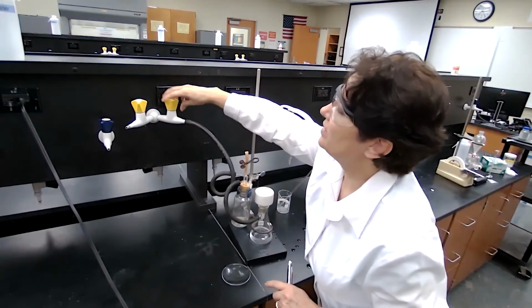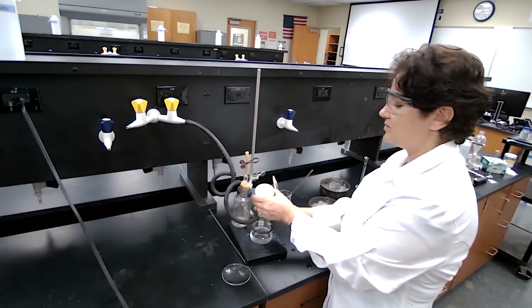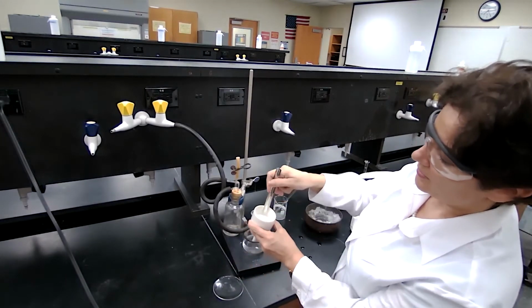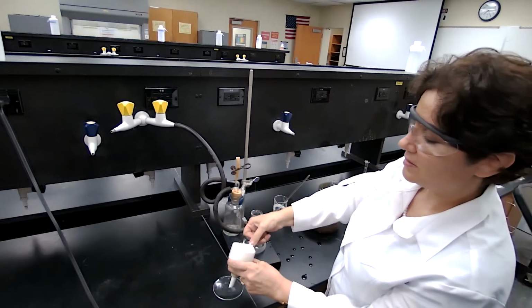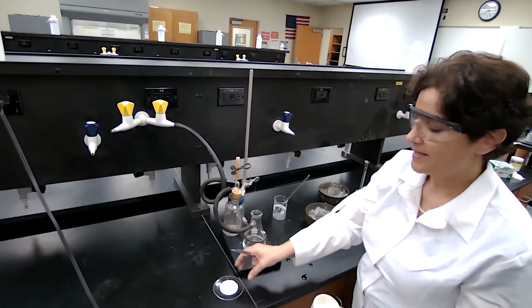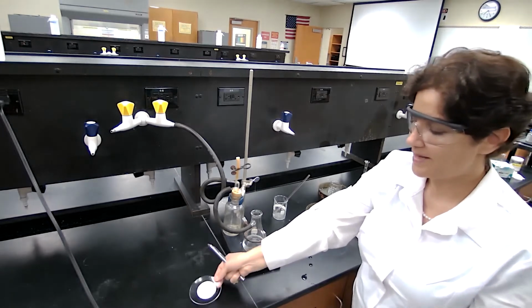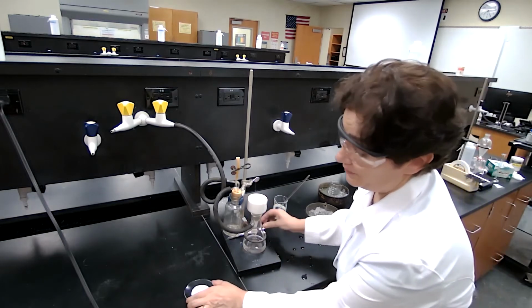After the extra 5 minutes of applying vacuum, now I can transfer the solid into the watch glass. You can just flip it just like you would remove the cake, or use a spatula and remove the crystals with the filter paper and place it on the watch glass. Now we have the crystals. We are going to leave them in the oven to dry.